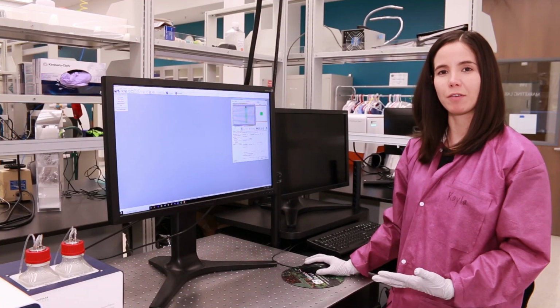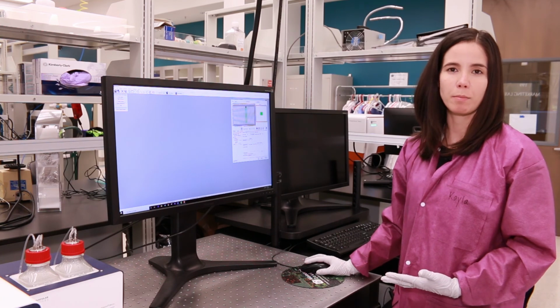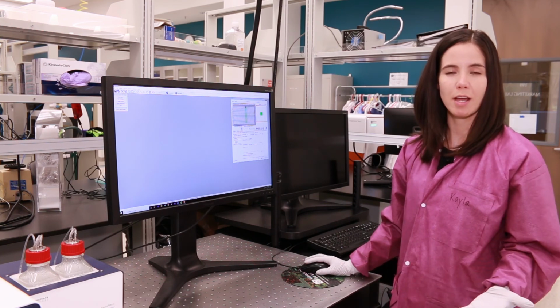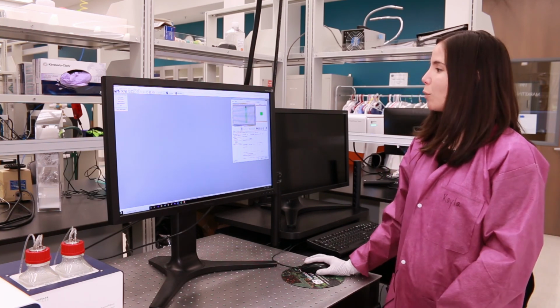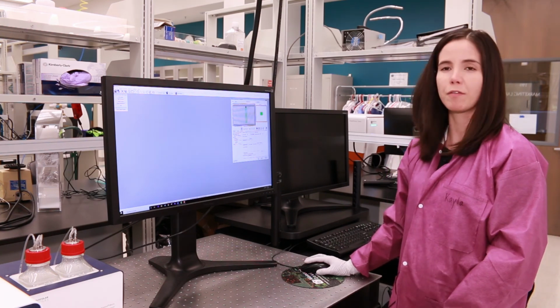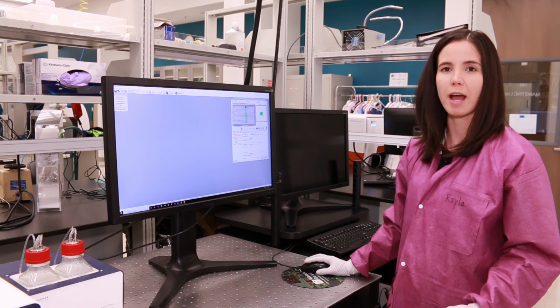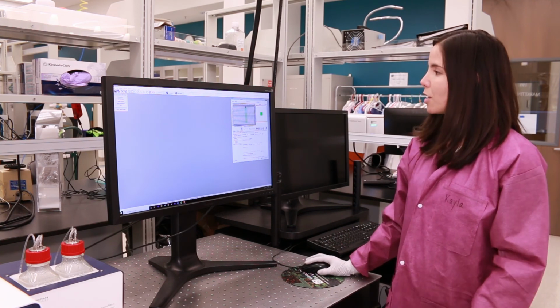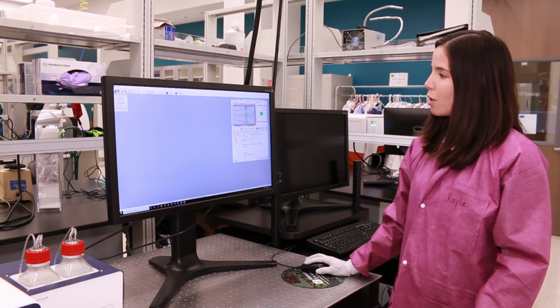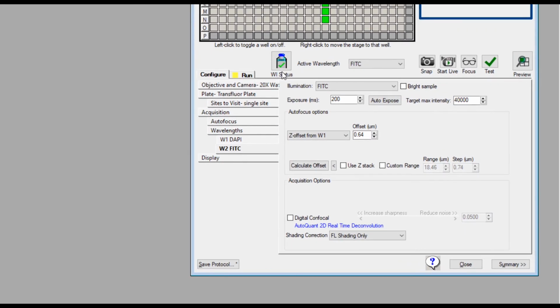As you can see from that workflow, using a water immersion objective is really seamless and no different than using an air objective. Now within ImageXpress software, you do have a few cues and health sensors that help you address any issues with water immersion objectives. In your plate acquisition setup dialog, you'll see this icon here to indicate the water immersion objective status.